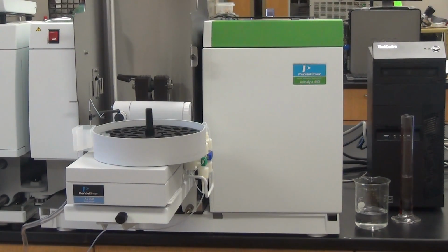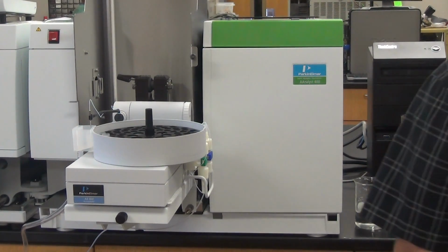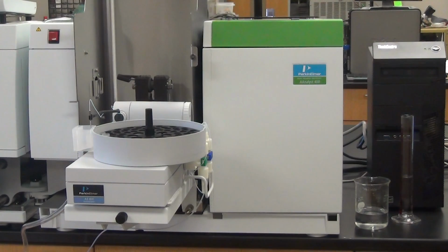Now I would normally hit analyze all, which means we run the standards, we run the blank, run the standard, run the sample.